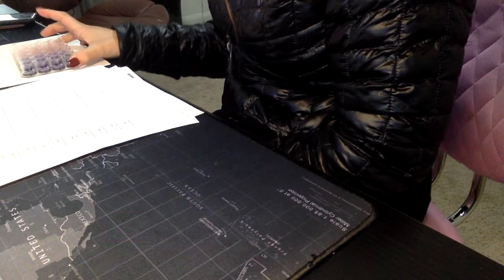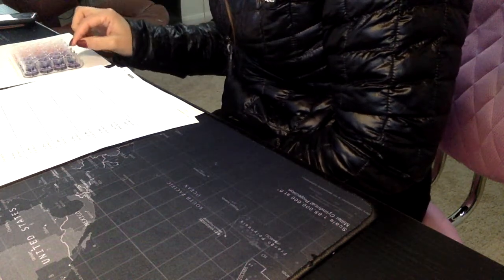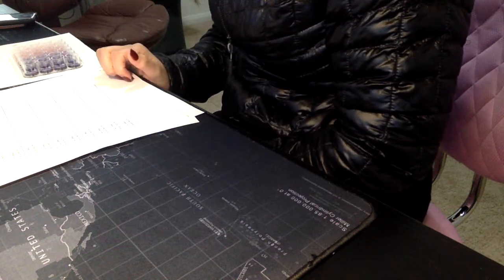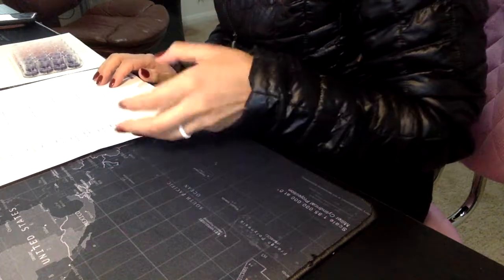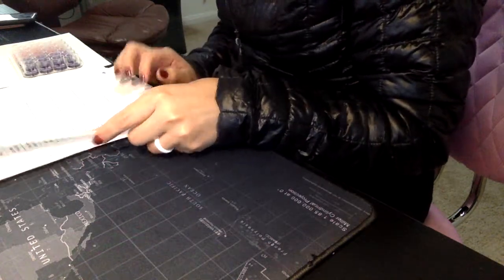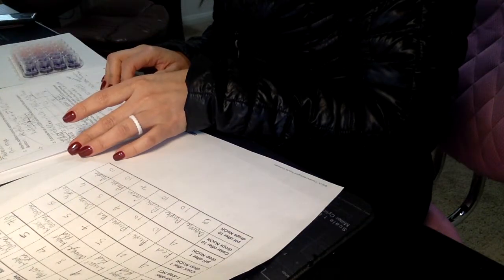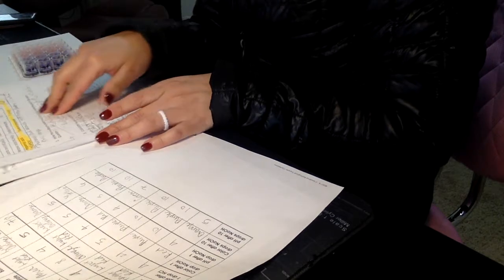As we were adding more of the acetic acid, I saw a more drastic color change, meaning the pH was changing. That's just what I saw on my video. So, data table number 1, data table number 2, with the calculations that I got, using them in the discussion questions here.